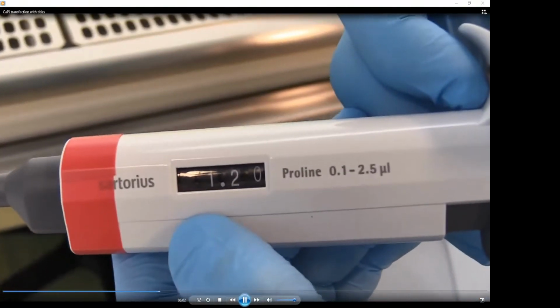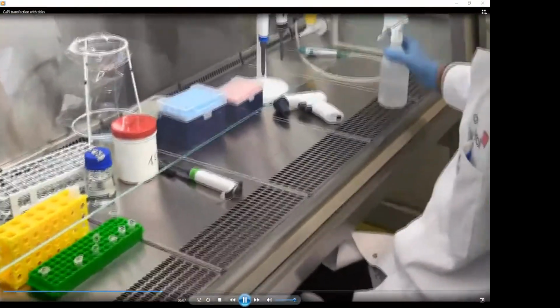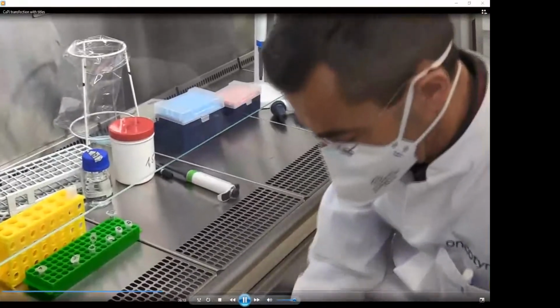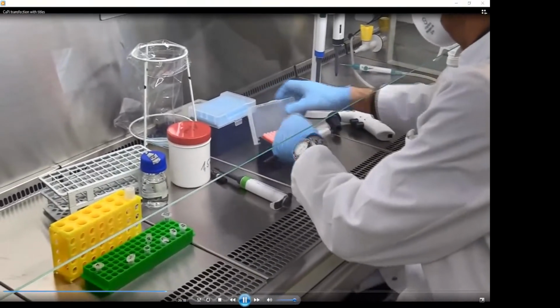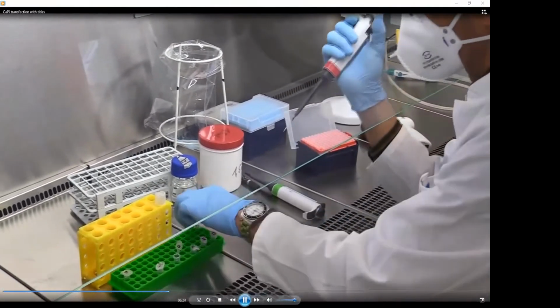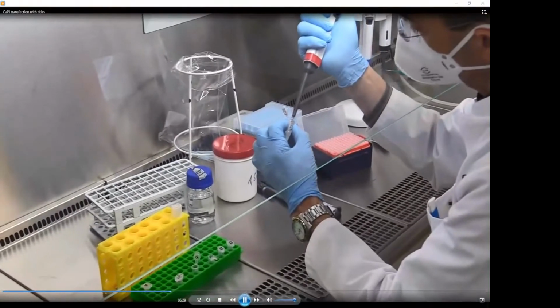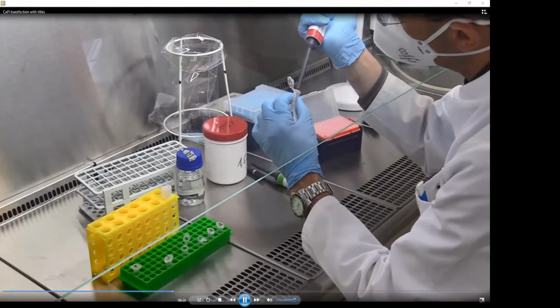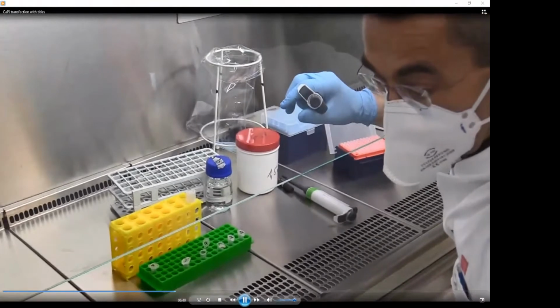This is 1.2 microliters of pHMT. pHMT is actually for bacterial expression of DNA in bacteria, not in mammalian cells, but chemically seen, it's a DNA. The reason why we use it for the control transfections is that we learned that certain types of reporters, in particular this TOPflash, are somehow regulated by other plasmids containing CMV promoter. So it's not a good idea to use empty plasmid vector with CMV promoter.